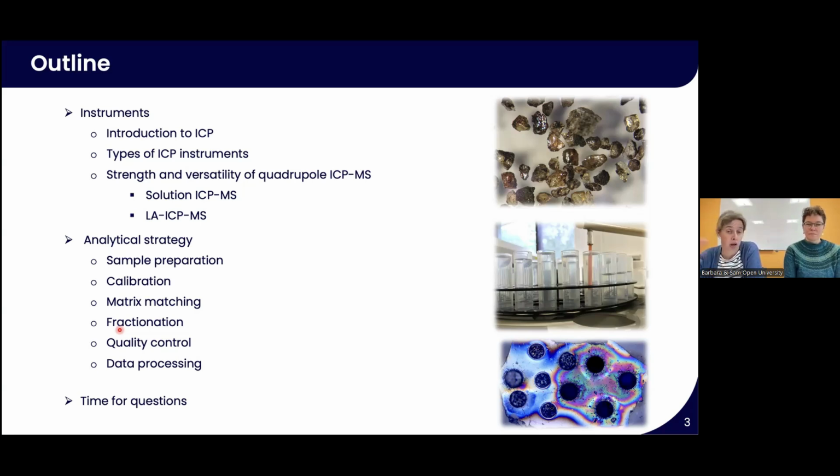And we're going to talk about both the solution and the laser ablation introduction systems and the benefits and disadvantages of both of those. In the second part of the talk, we're really going to think about analytical strategy, and this relates to quadrupole ICP-MS, but also goes much deeper into other analytical techniques that you might be using. So thinking about how you can get the best data from your samples.